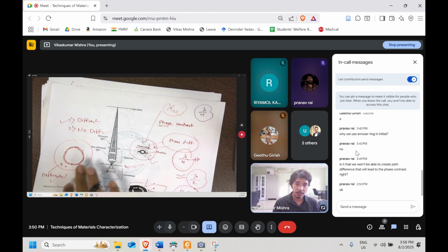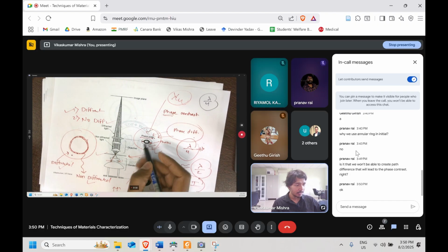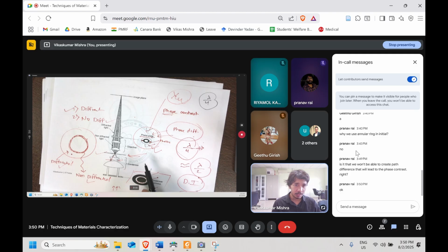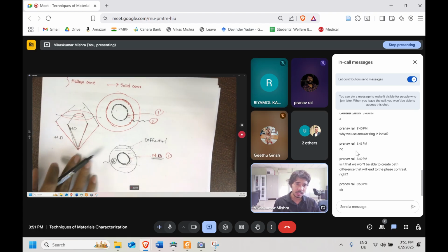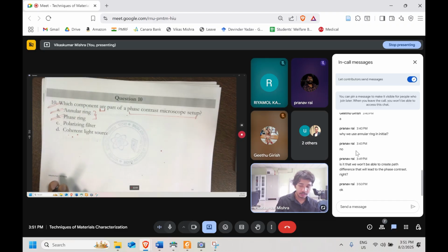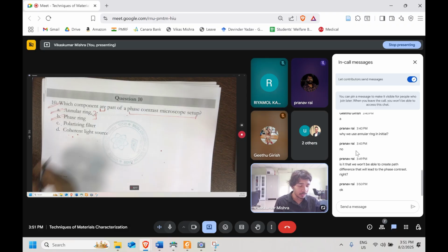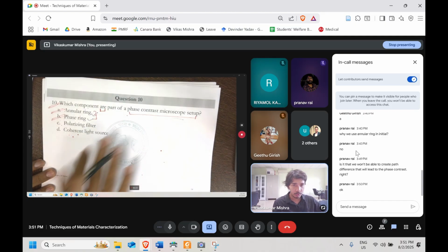Okay, and this is what happens in the defect known as halo. There, what is happening? See, we cannot achieve everything we try to. Nothing can be ideal. That's why some leakage is happening, and that leakage is what leads to the formation of the halo, which we saw in the class. Okay, since it's clear, let's move ahead. So for question number 10, we can say that the annular ring, which we have discussed thus far, and the phase ring, they both are part of phase contrast microscopy. Okay, so question number 10 is over.